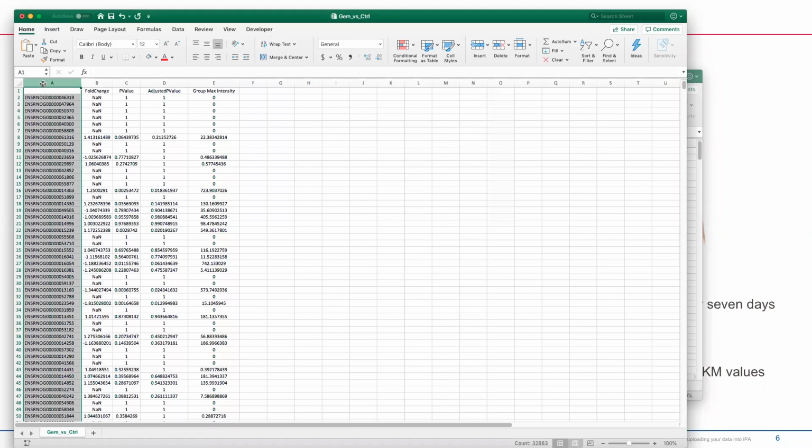You can have just one column with different types of identifiers, and IPA will look at that while it's scanning the data set, and it will be able to make smart assumptions about the type of a number of different identifiers you have. But you can also place each ID type into a separate column if you wish, and you can have up to 5 separate columns. But it's really important that your leftmost, first column does contain the identifier.